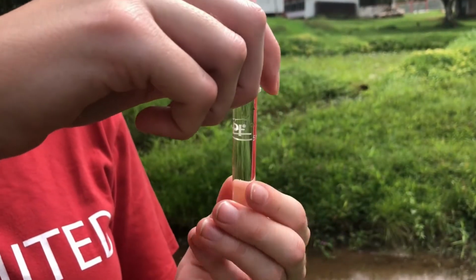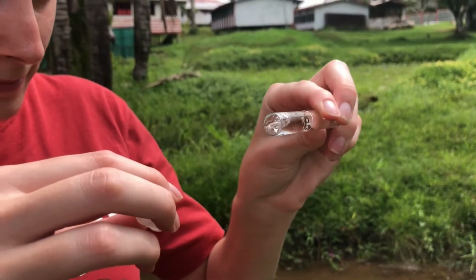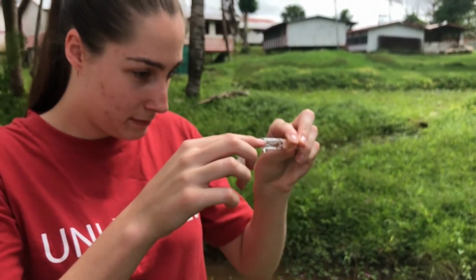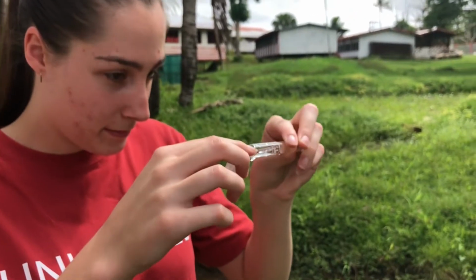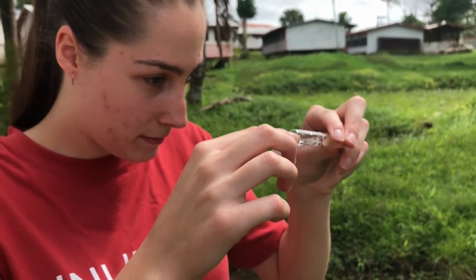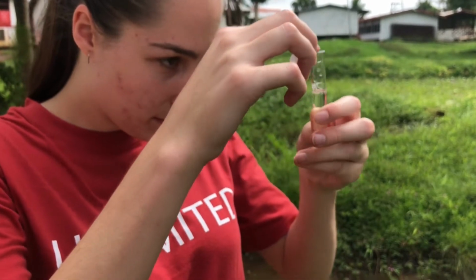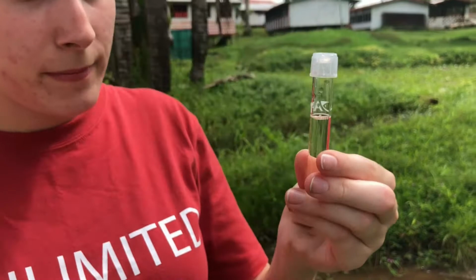Each of the 4 samples have to be tipped down to the line, which is 5 milliliters. Do it slowly and carefully. And put the cap back on.